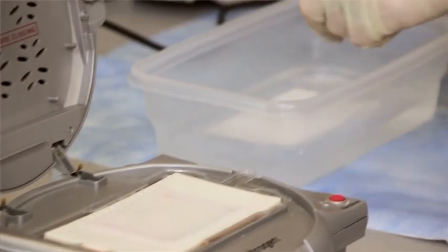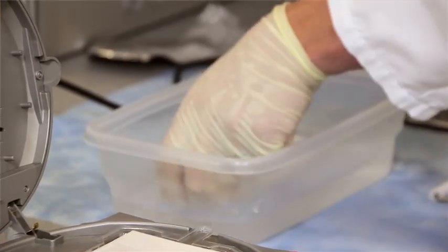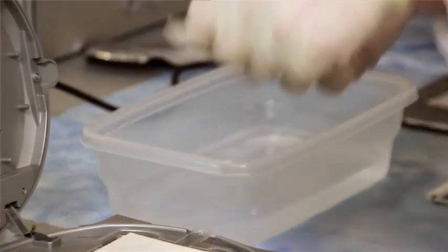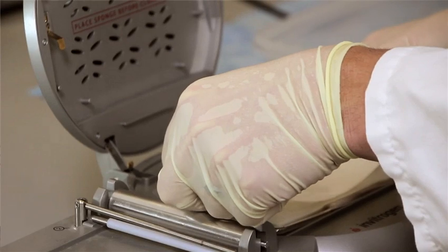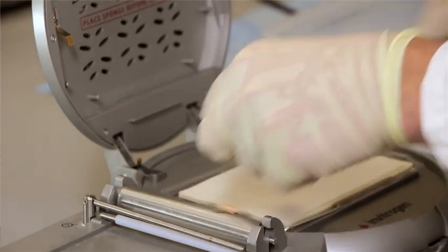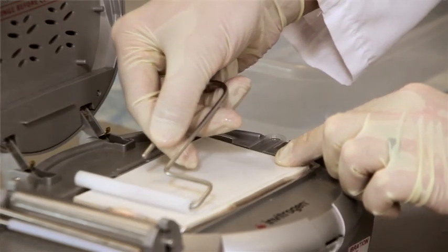Okay, and then we're going to pre-wet our one filter paper. Put that on top. Then use our roller to roll out any bubbles.